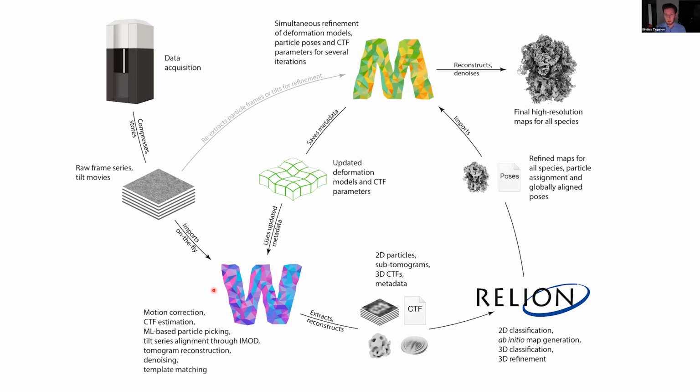Then it reconstructs the maps, and hopefully after one or several rounds in this accelerator ring, your particles fly out as really nice maps at high resolution. And so I know I promised to talk about new tools for tilt series, but historically, the development of M started with frame series refinement.